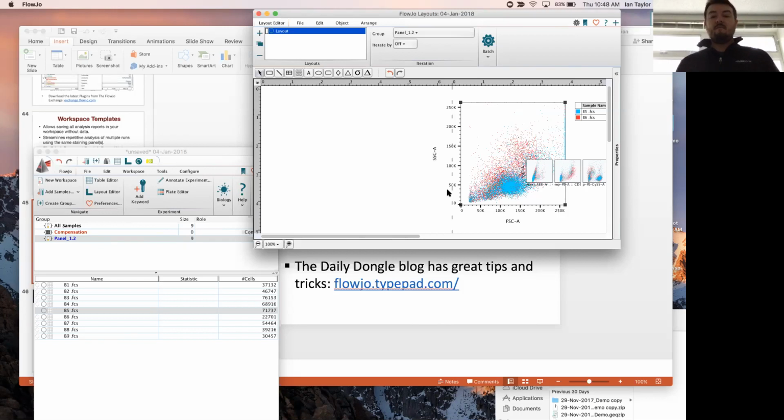But obviously, maybe one event is not something that you could consider rigorous in the statistical significance. So that's a great question. You should always use more events whenever possible for doing statistical tests.